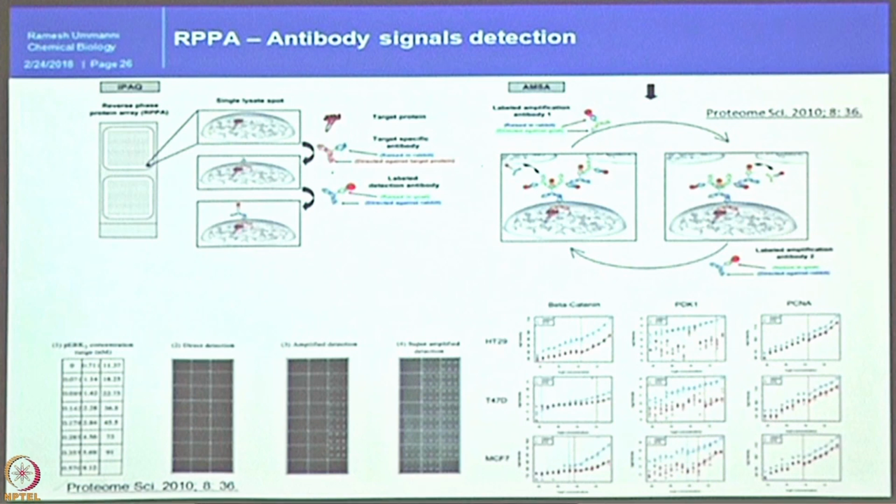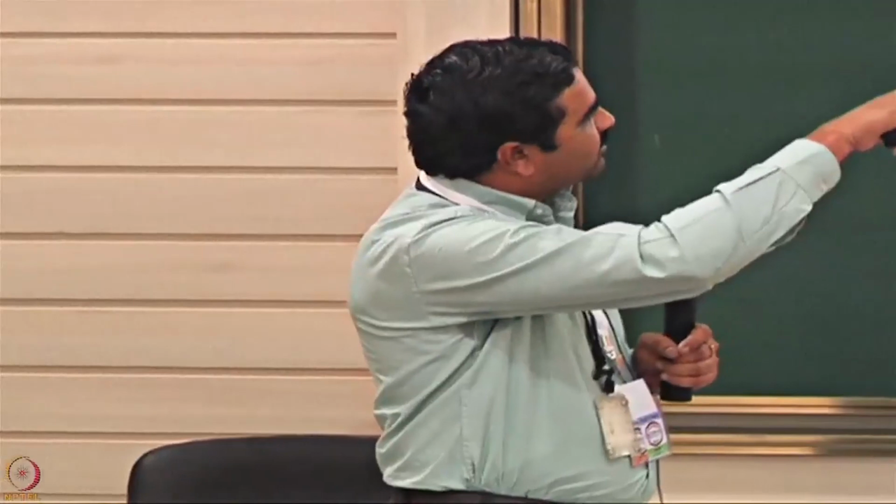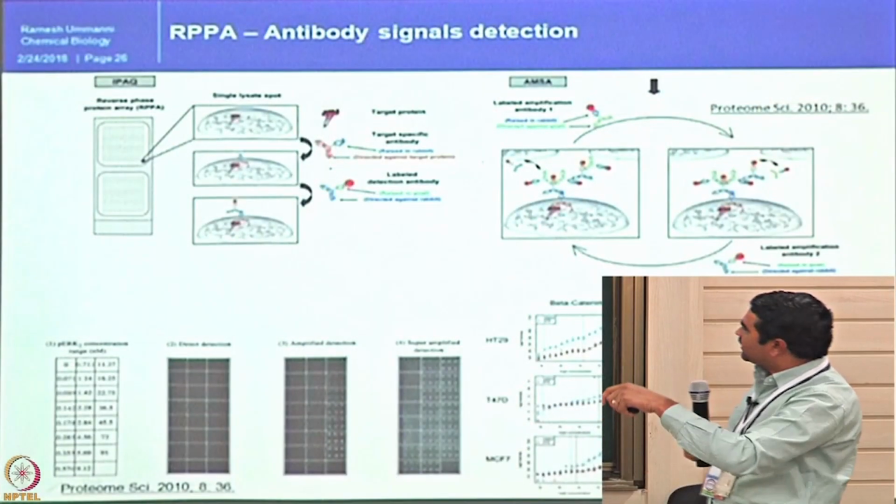One molecule of infrared fluor is attached with one round of secondary antibody, and the secondary to secondary antibody will have two fluorophores there. Then if you repeat this for 3 or 4 or 5 antibodies, so that one protein target is attached to 5 different signaling molecules, then obviously your signal will be increased by 5 times. So this reiteration step will increase the signal.